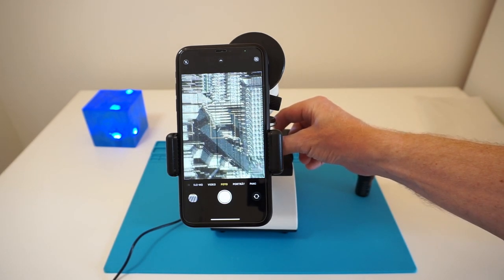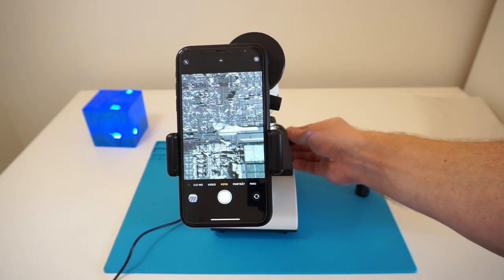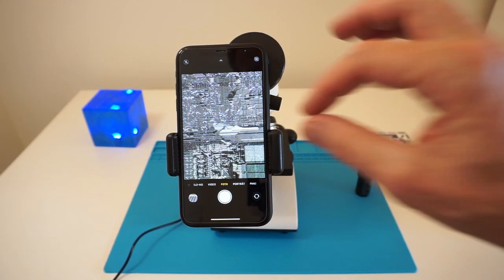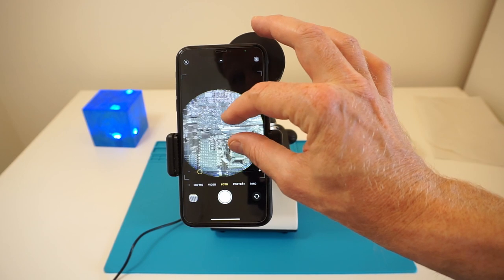The reason it's tilted is because the object hasn't been aligned yet, but I can do that here. And here you go, here you have your image. It looks quite sharp. You can even digitally zoom in further. You can zoom out again.